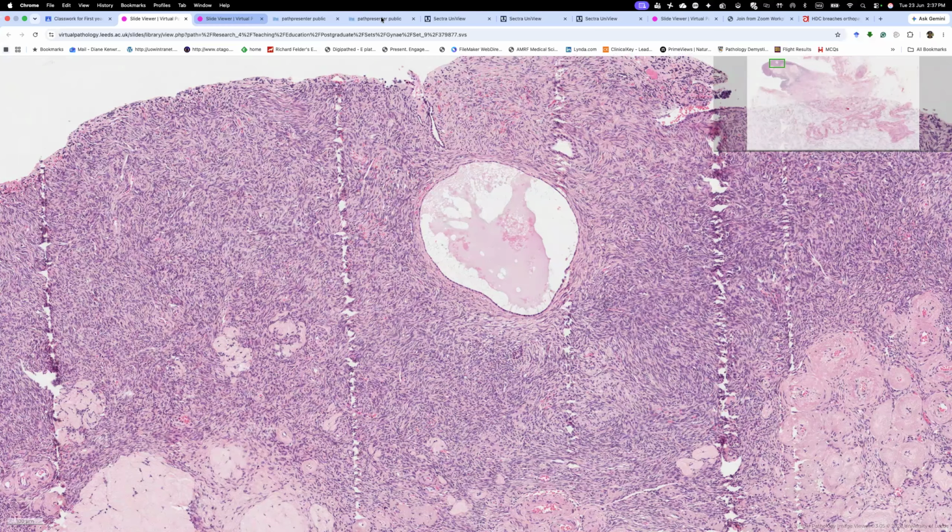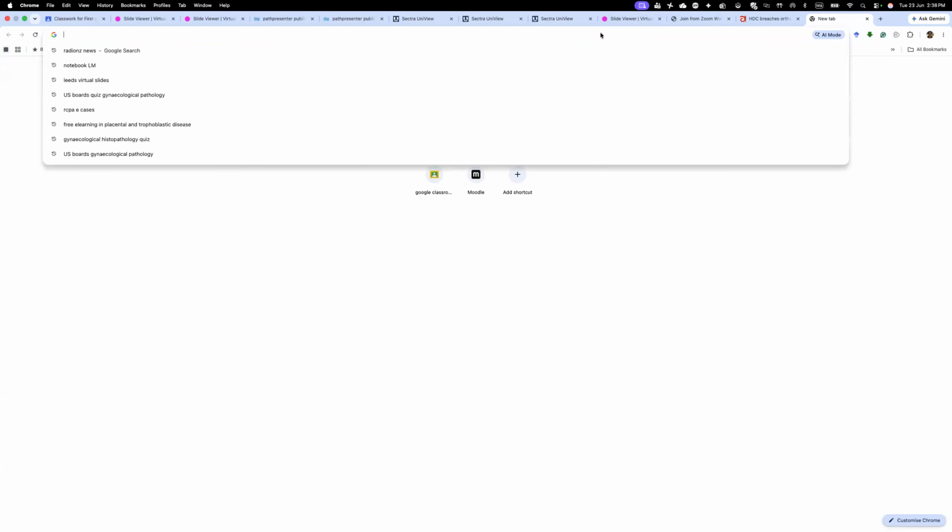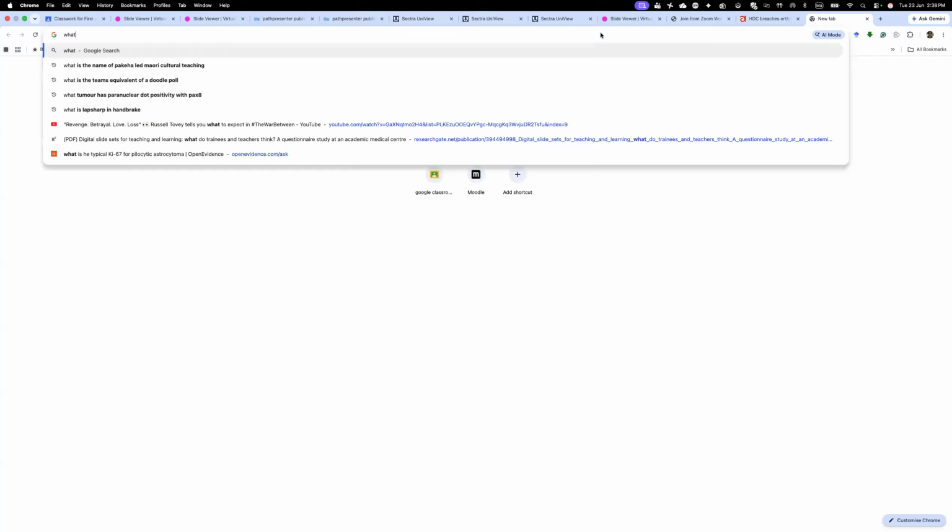I actually don't know the answer to that. I'm sorry, but I'm just going to look that up. All right, who can look it up faster than me? This is now a challenge. We're going to try and work out what they're staining like.